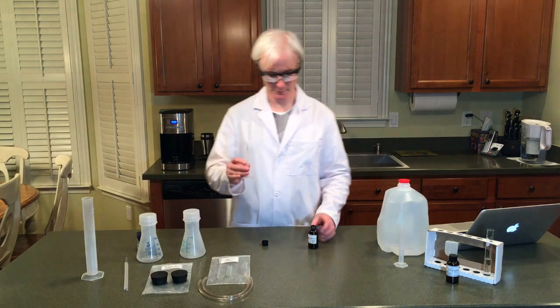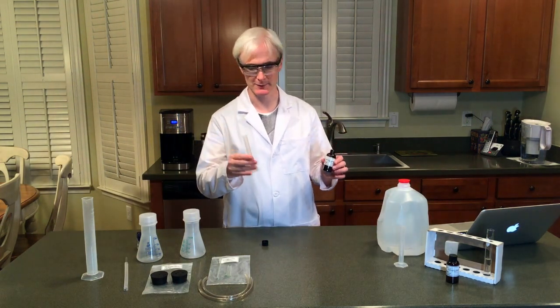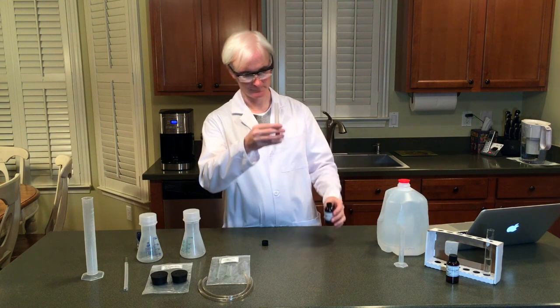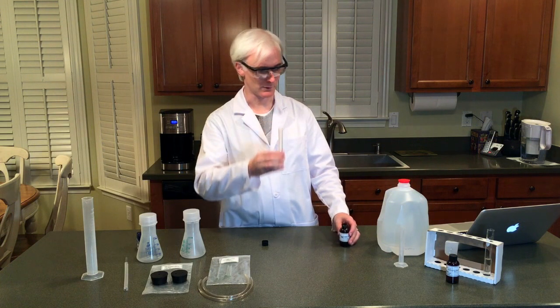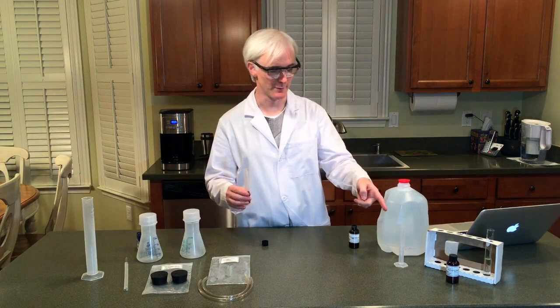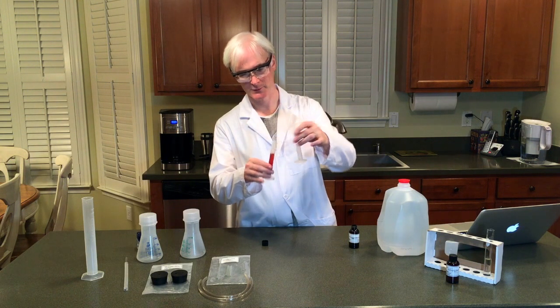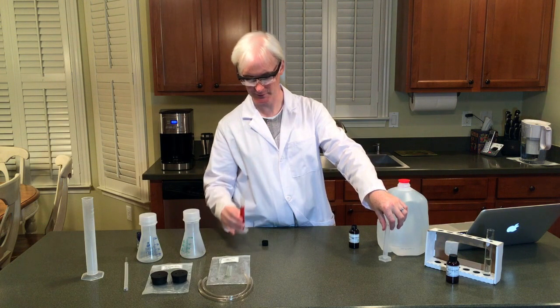First up, we're going to add 5 milliliters of iodine potassium iodide to a graduated cylinder. Don't forget about the meniscus. And to this, we're going to add 5 milliliters of distilled water, which I've measured into this graduated cylinder here. We're simply going to add this to this to give us 10 milliliters of solution — and we have 10 milliliters, so this is good.